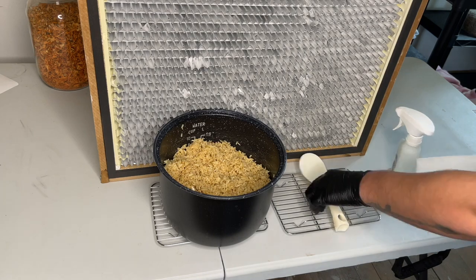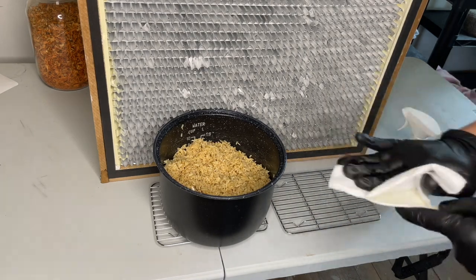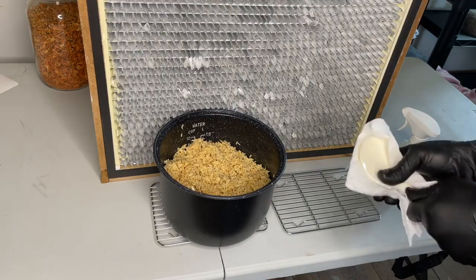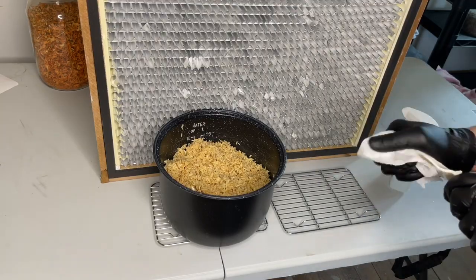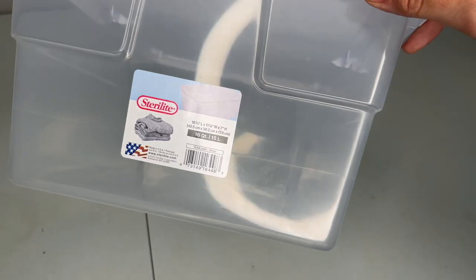Remove the insert from the instant rice cooker and allow it to cool down completely in front of the laminar flow hood. While the rice is cooling down, you can start prepping your 16-quart Sterilite container.